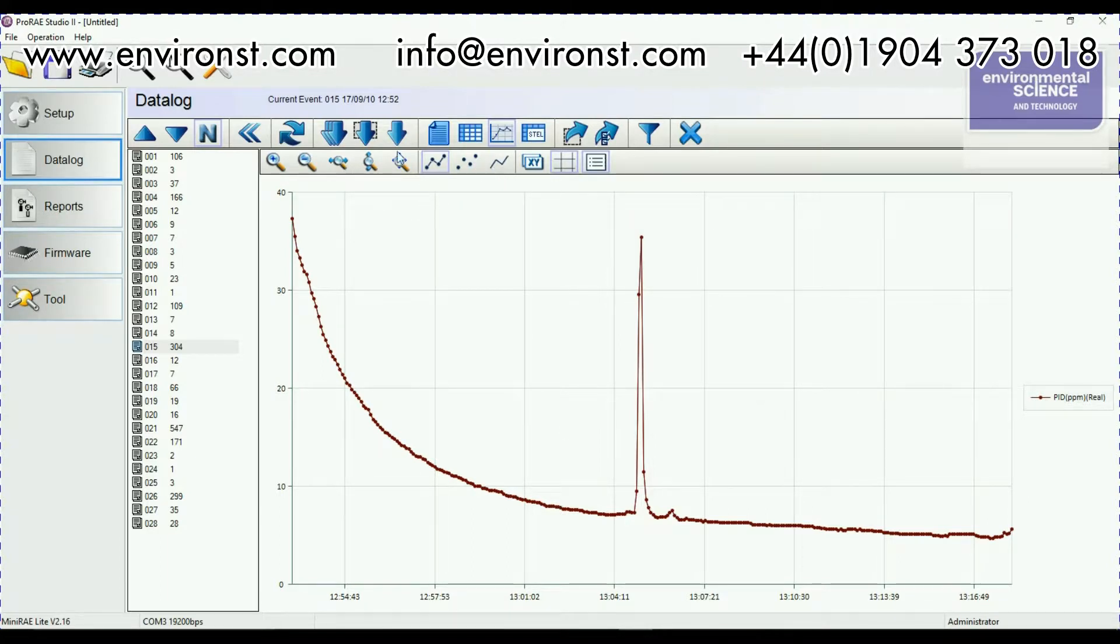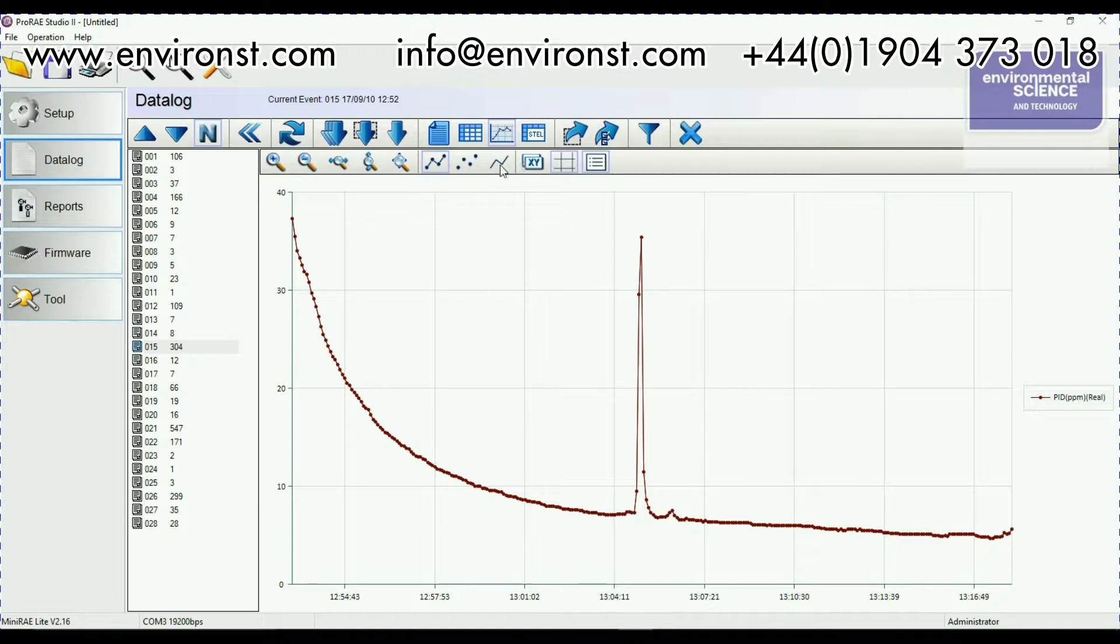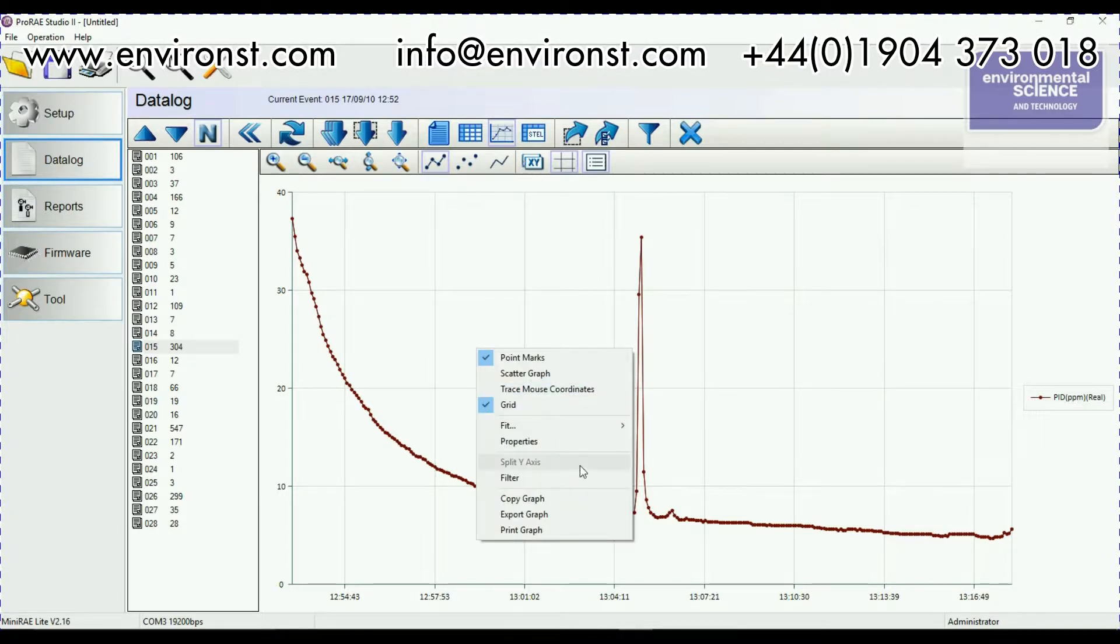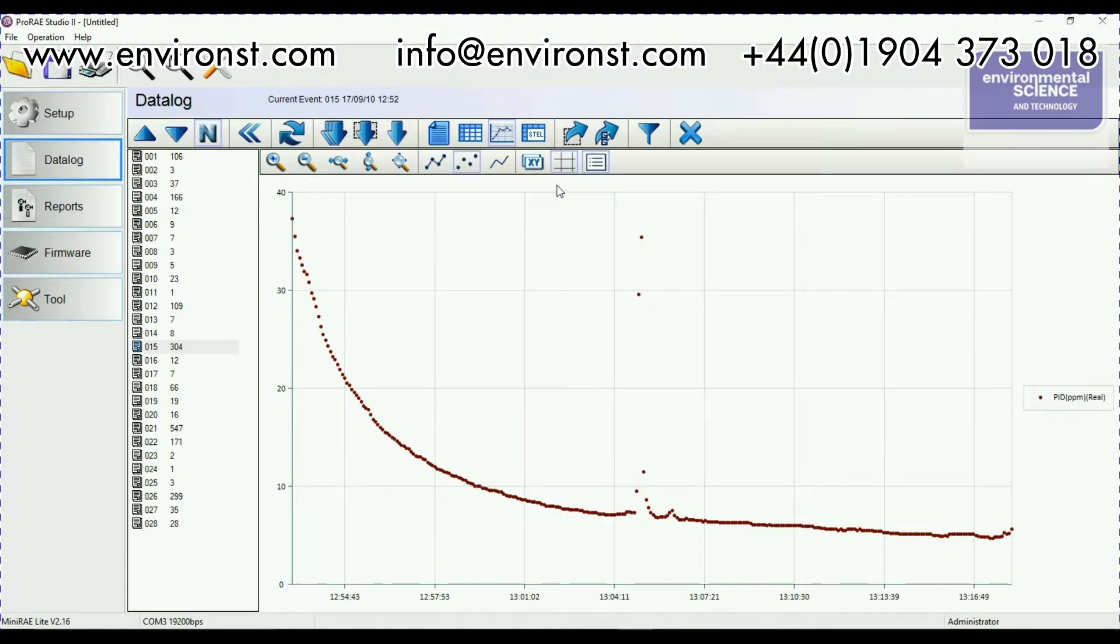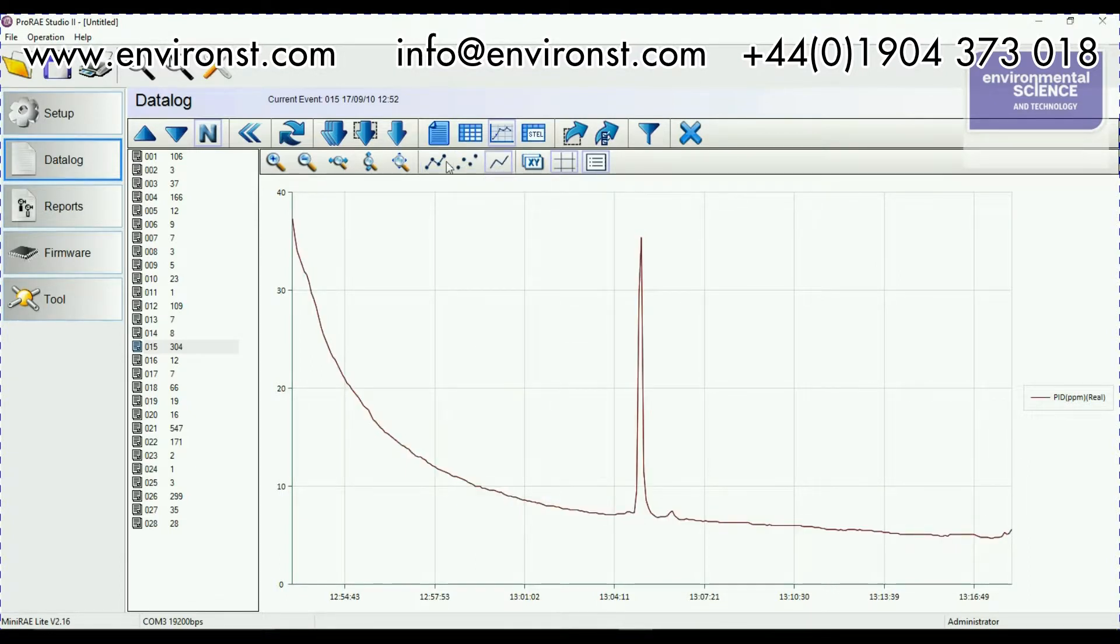Now we can adjust this graph with these tools up here so we can zoom in, zoom out, we can right click on it, we can copy the graph, export it and it will print. We can change the format and say data points or just lines. So all fairly easy.